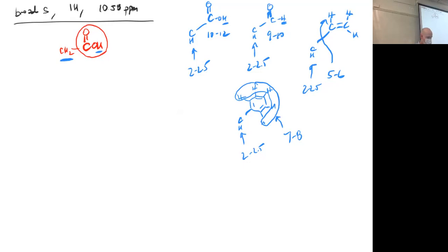All right, Bree, you're back up again. I'm gonna give you the worst one. It's just number 8 on the list. Oh, nope, we're gonna get to that one later, sorry. This is not the worst one, it's just the next one. 8P, 1H, 1.36 ppm.